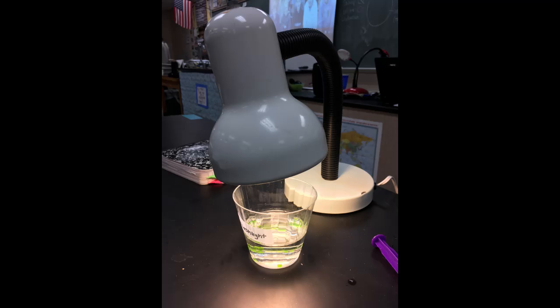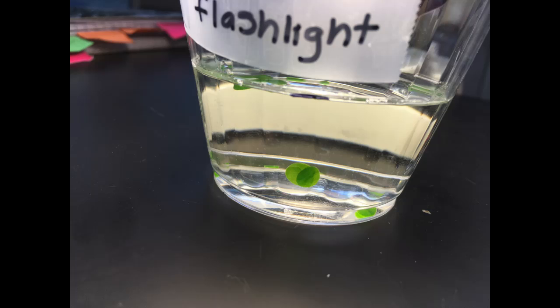And we made each cup with the fluid at a height of 3 centimeters, which eliminates any variables that would change the experiment if the level of fluid or sodium bicarbonate was higher. So that was just another control. And we tested each one under a duration of around 15 to 20 minutes.